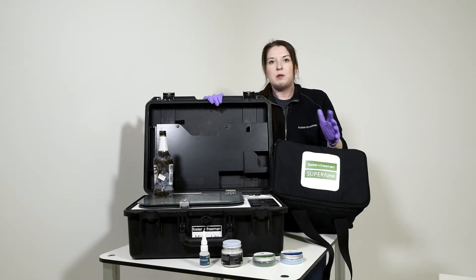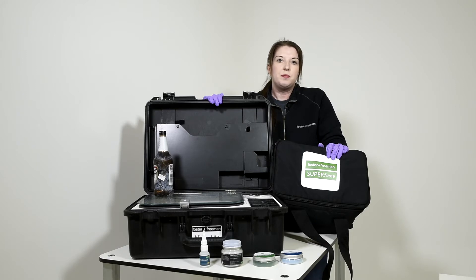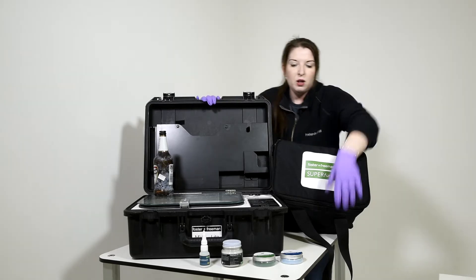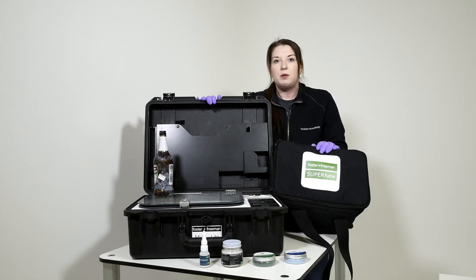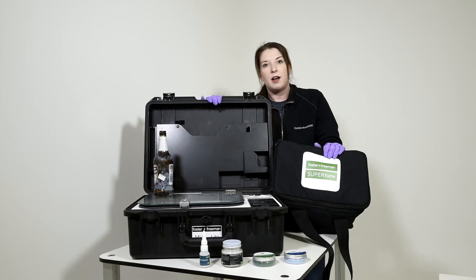Once you've developed your fingerprints, how do we image them and how do we see them? This is where we would use our different light sources. We're going to talk about our Crimelight Xs and our Crimelight Auto. With the Crimelight Auto, if you're looking at superglue or cyanoacrylate marks, you can use reflective UV capabilities. With the FP Natural Powders, we can perform IR fluorescence imaging, and with Polycyano, you can do UV fluorescence imaging.